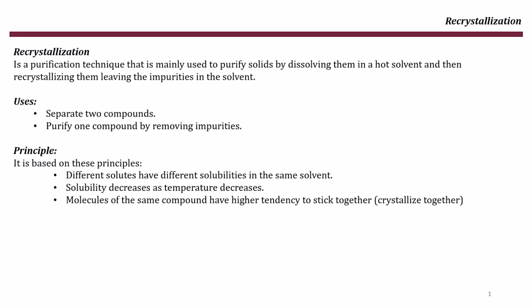A common mistake students make is thinking that recrystallization works with any solvent. In reality, you must carefully select the right solvent where this solubility behavior can be observed.